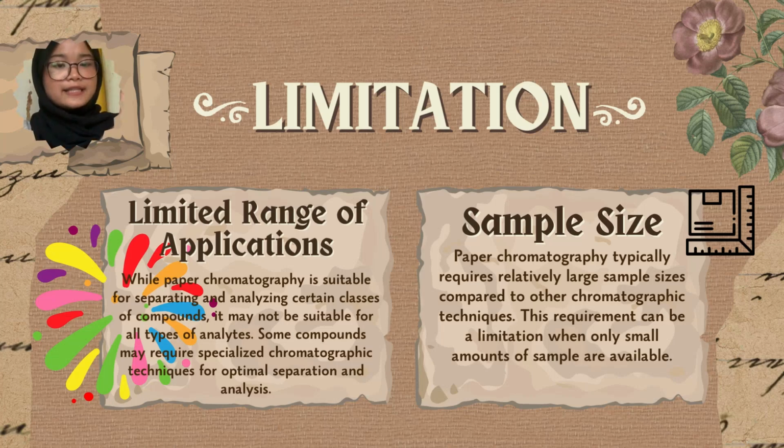The second one is sample size. Paper chromatography typically requires a relatively large sample size compared to other chromatographic techniques. This requirement can be a limitation when only small amounts of sample are available.